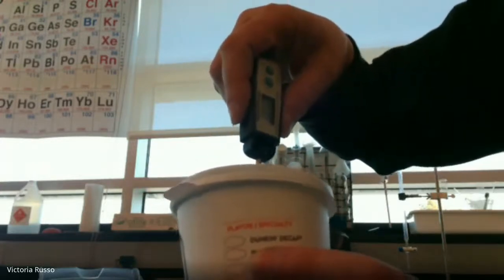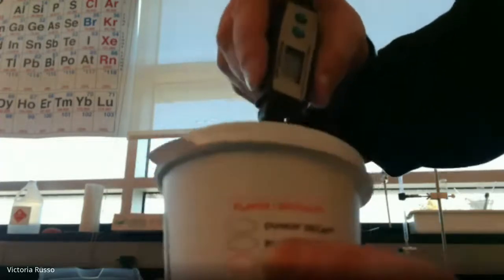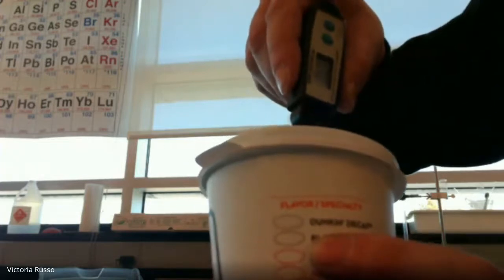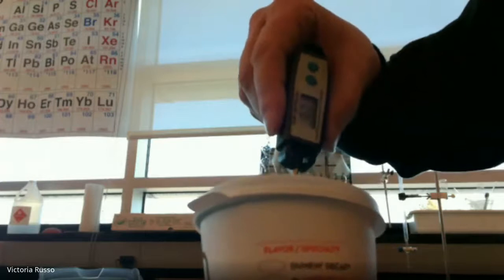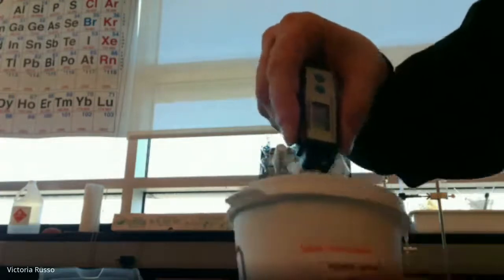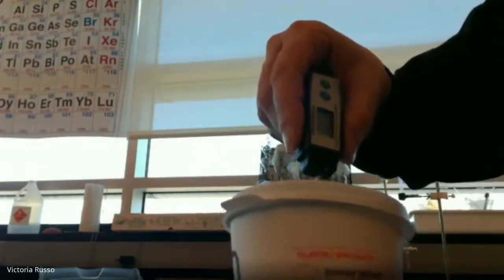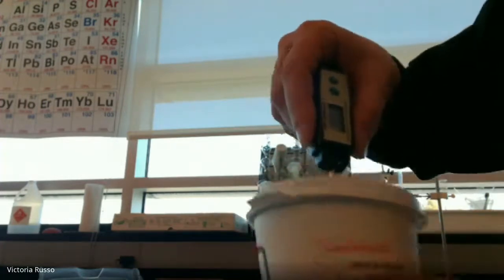32. 35. Still going up. I can still hear the sizzling. We're still going up. 36. And I can still hear the sizzling. Again, when the sizzling stops, I know the reaction is over, and I want to shake it a little bit to make sure all the pieces are reacting. Still going up. Reaction is still occurring. Shake, shake, shake.